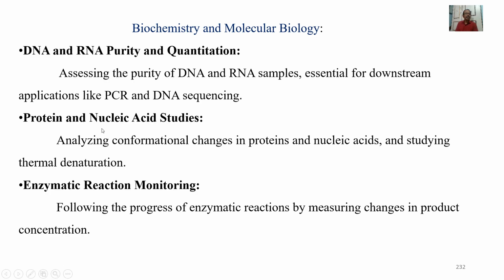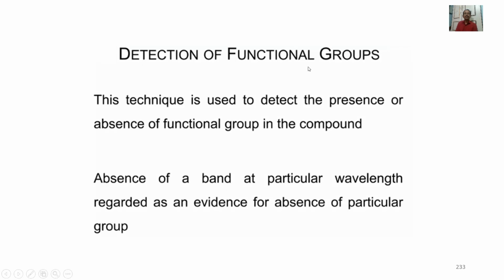Protein and nucleic acid studies. Analyzing conformational changes in proteins and nucleic acids and studying thermal denaturation, enzymatic reaction monitoring, following the progress of enzymatic reactions by measuring changes in product concentration. Detection of functional groups. This technique is used to detect the presence or absence of functional groups in the compound. Absence of a band at particular wavelength is regarded as an evidence for absence of particular group.